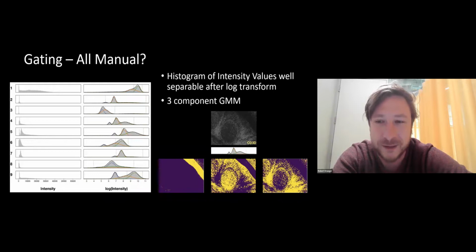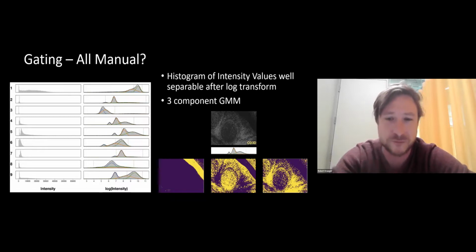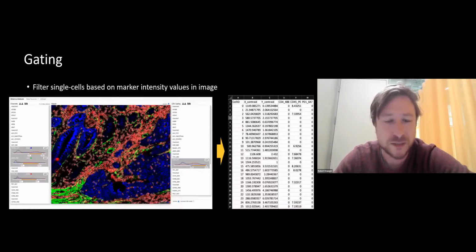of the cells. So using that Gaussian mixture model helps us a little bit with the color mapping and the transfer function usage. So this is the tool to do this gating process.